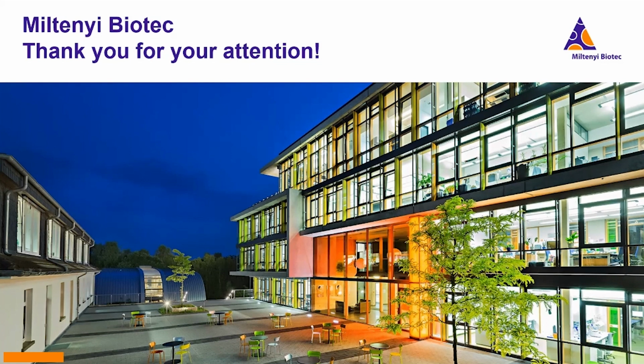Okay, thank you very much. Let's move on then. Is nuclei hashing after nuclei purification with microbeads possible? I think I will take over this question if it's okay for you, Benjamin.